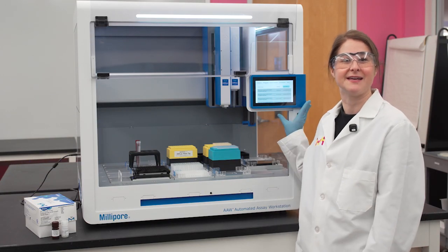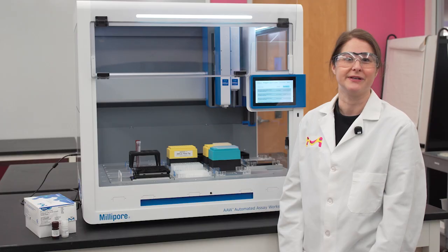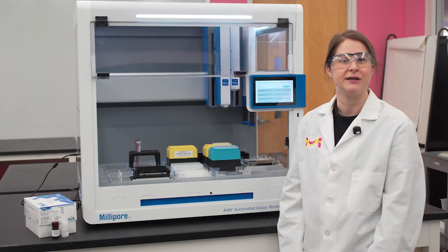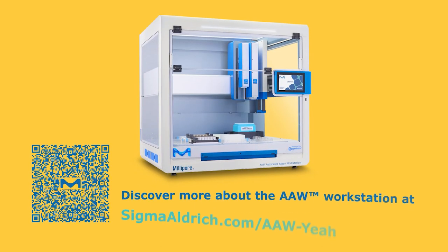Overall, you can see the AAW automated workflow further enhances sample throughput and standardization by automating all assay steps except for the off-deck wash and overnight incubation steps. Check out our website for more info.